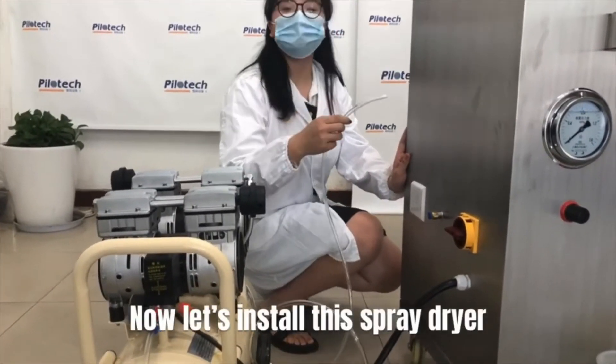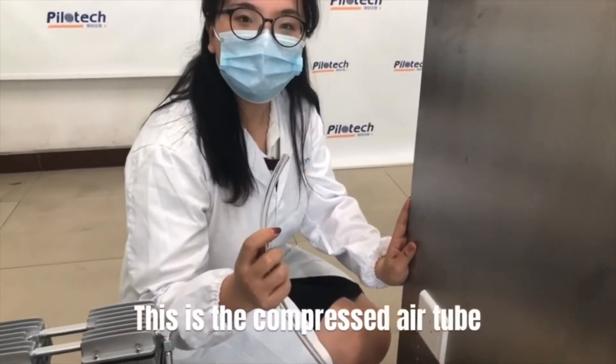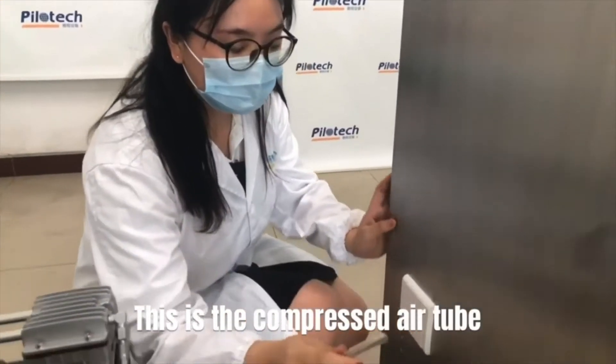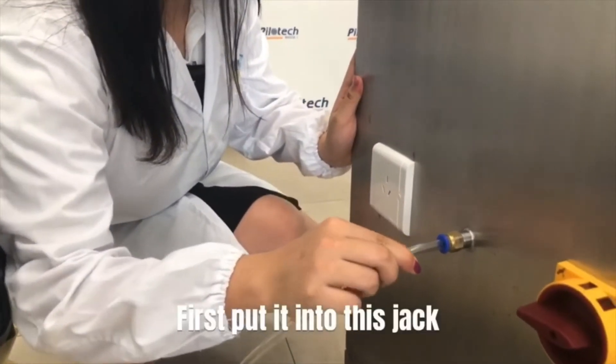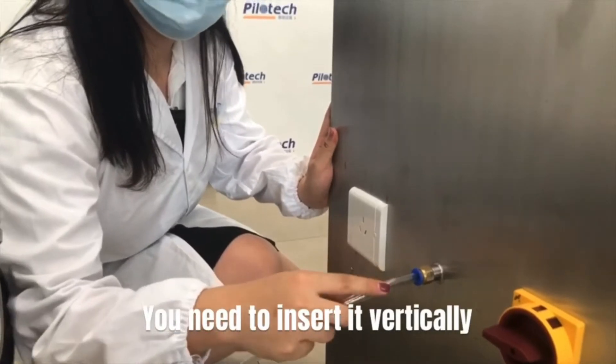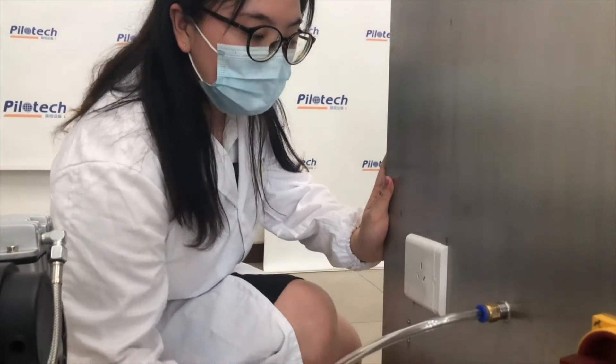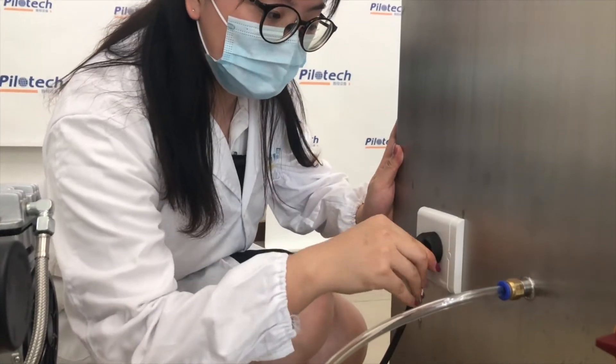Now let's install this spray dryer. This is a compressor air tube. First, put it into this jack. You need to insert it vertically and make sure it is fixed. Insert the plug.